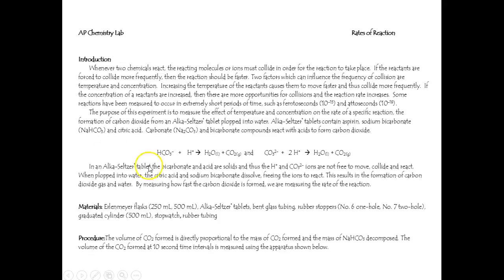So regardless of whether it's carbonate or bicarbonate, this happens to be bicarbonate, they would react with acid to form, technically, this isn't shown, carbonic acid, H2CO3, which then spontaneously decomposes. You don't really need to know it. Just go directly to the water and the carbon dioxide, which will outgas. And if it's CO3 2-, that would be carbonate, it also forms the same thing.